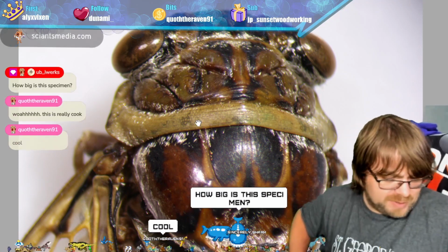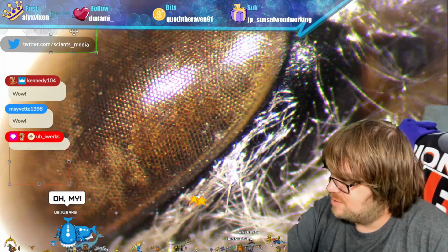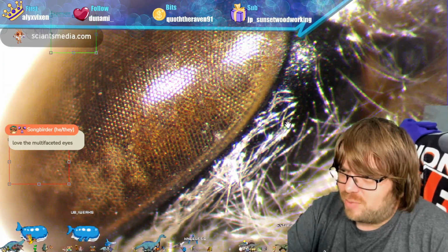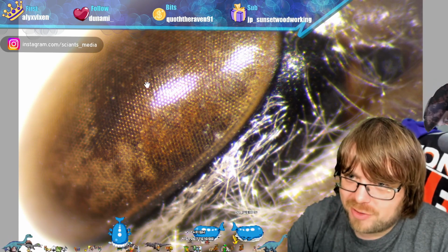How big is the specimen? Ubi, this is quite a small cicada. This is about 4 centimeters in length. There we go. See, each one of those circles is an eye cell. It has a neuron that runs deeper into the brain. So yes, as Miss Yvette points out, there are hairs around the eye of this animal, but I also find striking just all those little cells there.